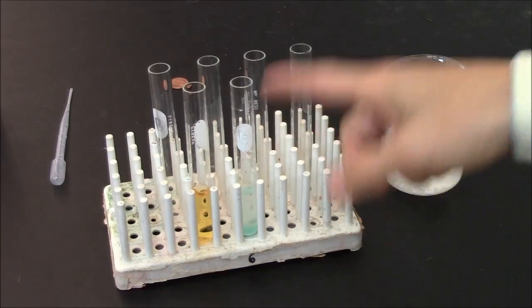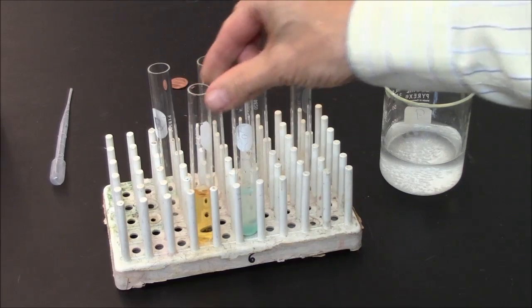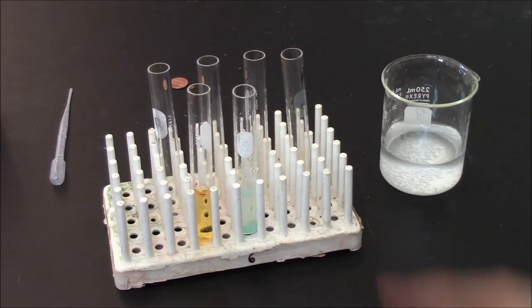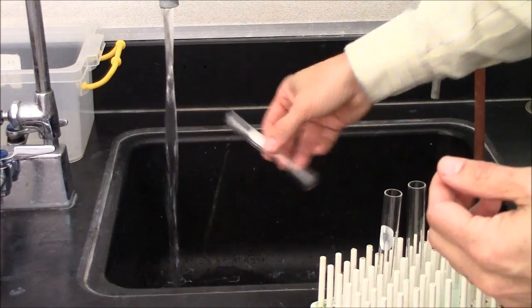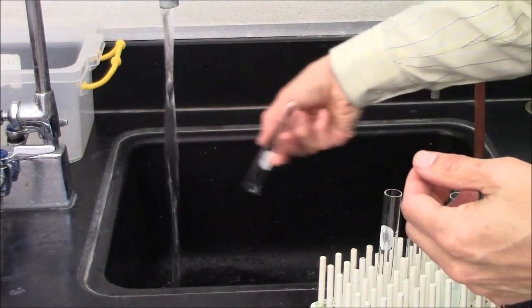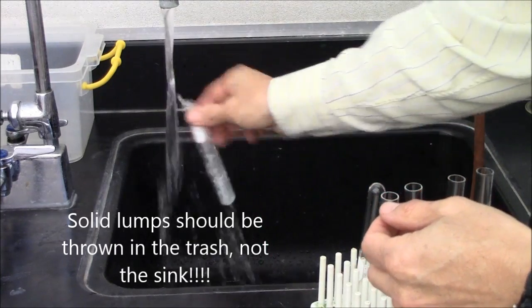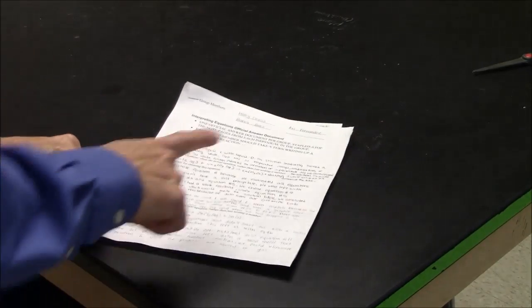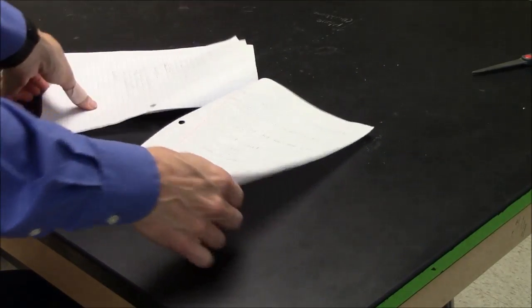I recommend you keep your reaction mixtures for as long as you can. Sometimes things will change over time. But at the end of the hour, you must clean up the glassware so that the next class has clean stuff to work with. Liquids can go down the drain. Rinse your tubes upside down. Before you leave here today, official answer page on the top, followed by the note pages from each individual person.